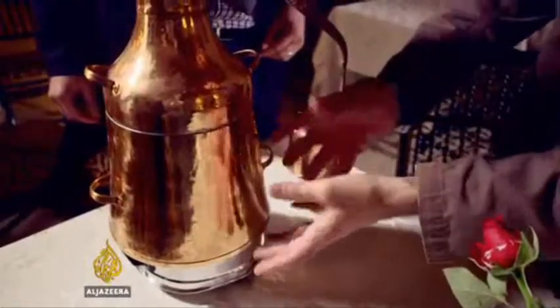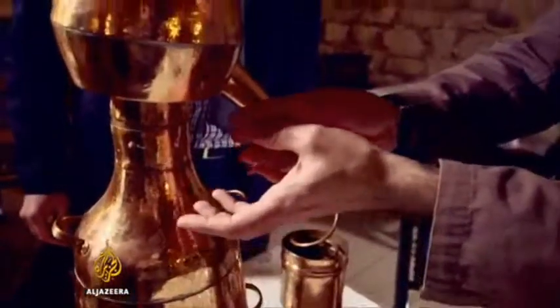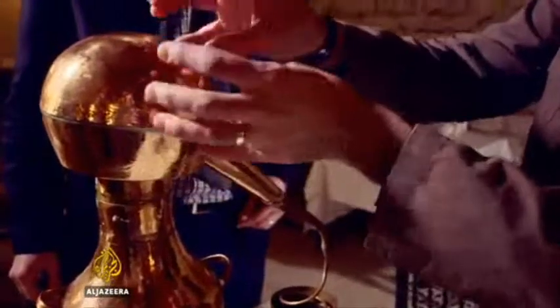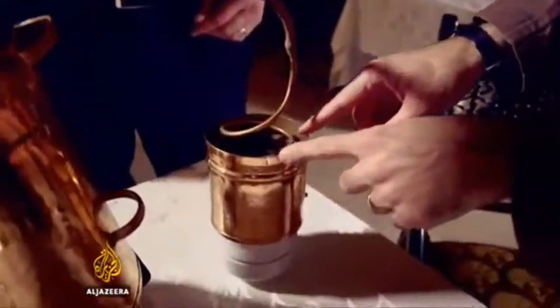So the water with the rose petals will be heated up here. As the steam is given off, it takes the scent of the roses. It reaches the alembic where it condenses back to a liquid and drips down here into this other container — it's like a slide.